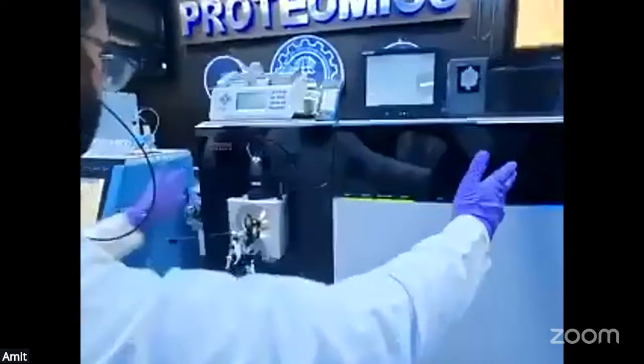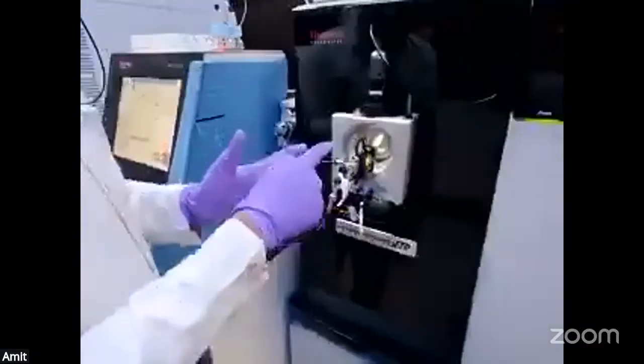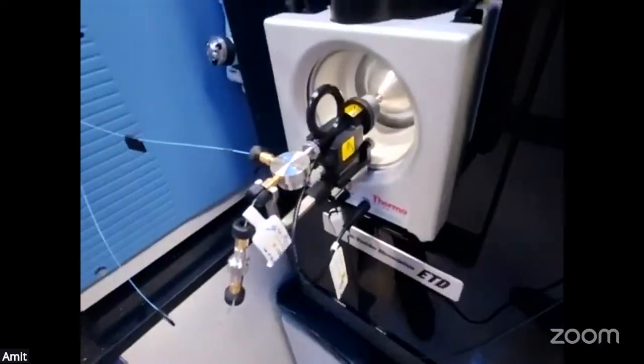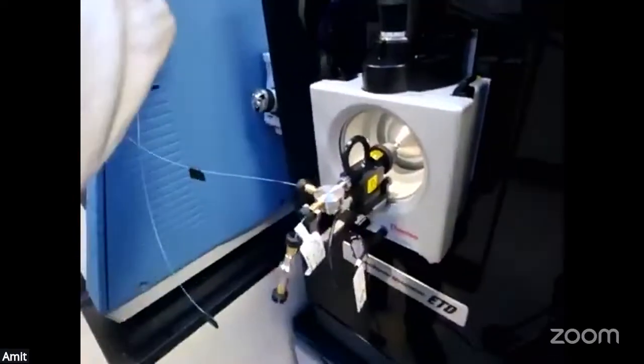So this is the mass spectrometer, which is connected to this nano LC. The peptides are getting injected using this column. This is a pre-column followed by a column. The column is nothing but a pack of C18 material that binds the peptides in the stationary phase, and when the mobile phase solvent comes, the peptides get eluted out and are injected into the mass spectrometer.